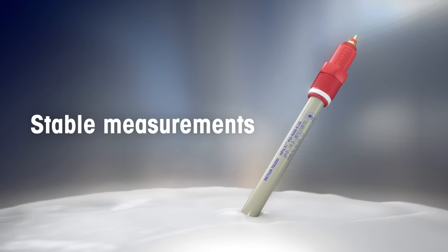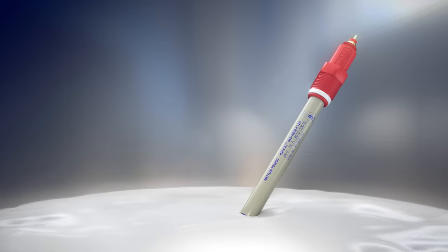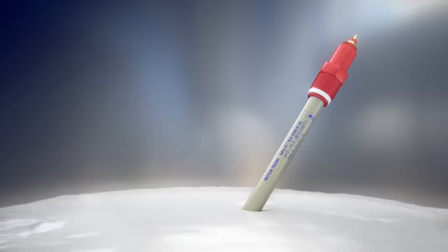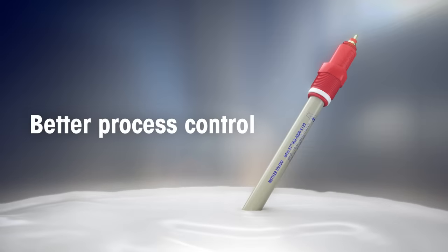Because the real-time measurements are so reliable, you don't have to measure pH in the lab. Along with exceptional product safety, inline pH measurement with the InPro X1 HLS will help improve batch yield and quality.